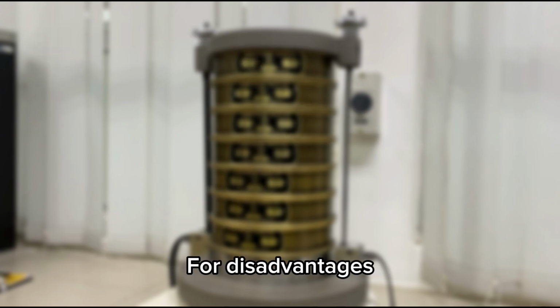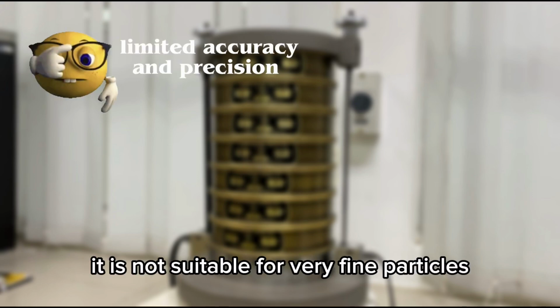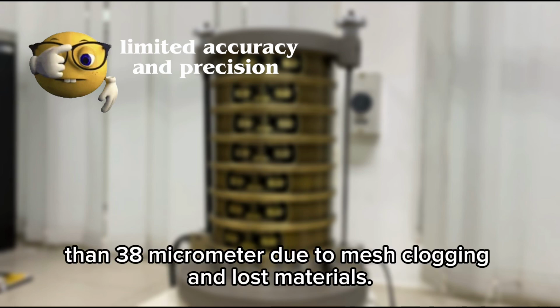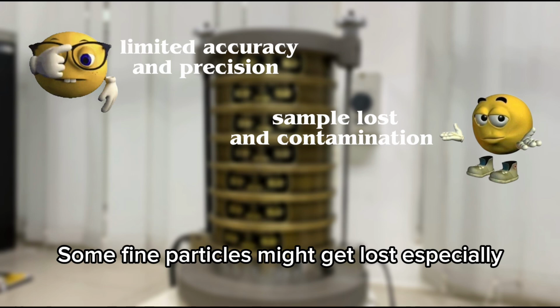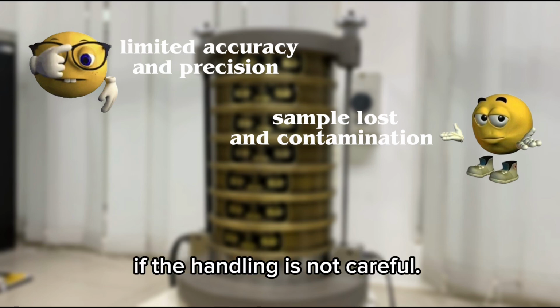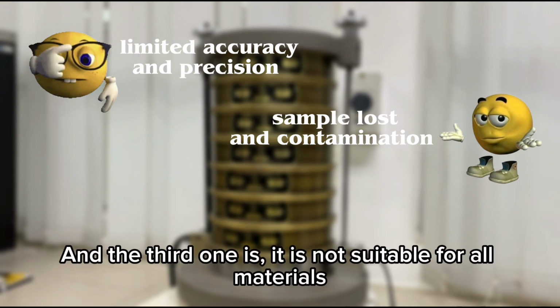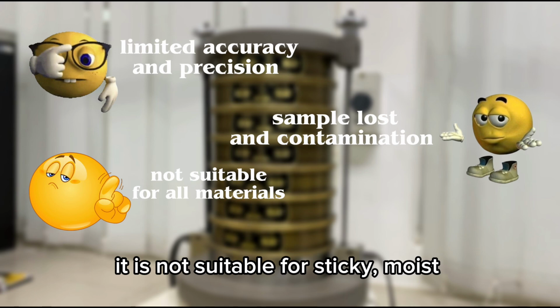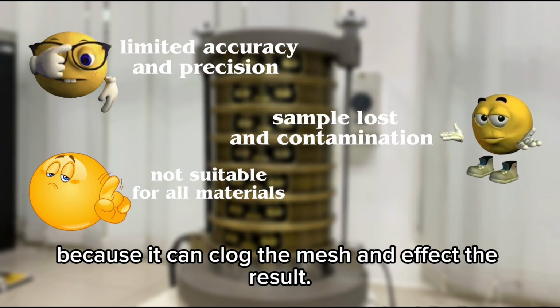For disadvantages, the first one is it has limited accuracy and precision. It is not suitable for very fine particles, lower than 38 micrometers, due to mesh clogging and loss of material. And the second one is sample loss and contamination. Some fine particles may get lost, especially if handling is not careful. There's also a risk of contamination between layers. And the third one is it is not suitable for all materials. It is not suitable for sticky, moist, or electrostatic materials because they can clog the mesh and affect the results.